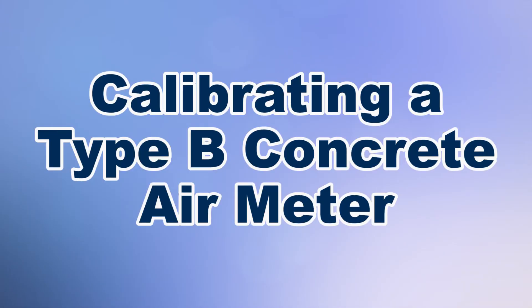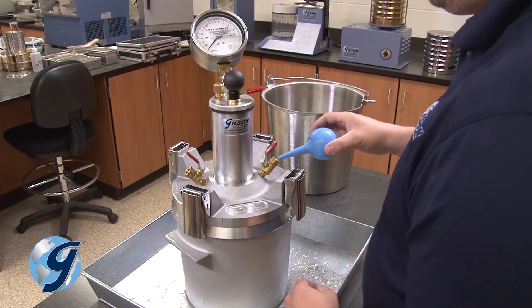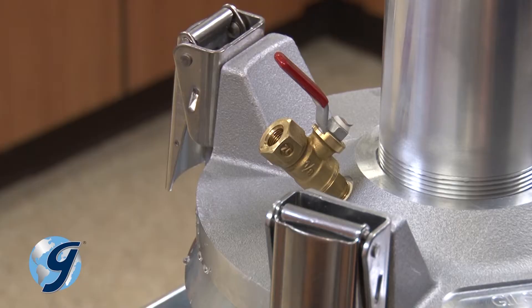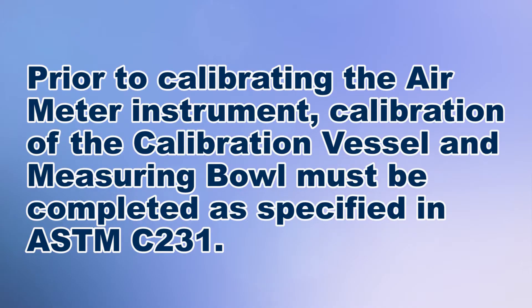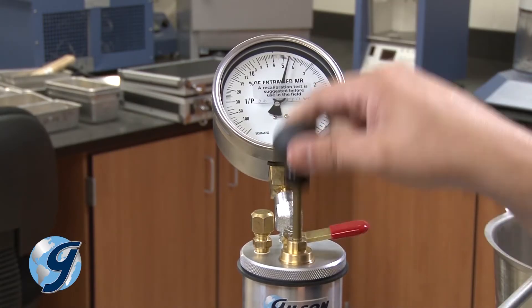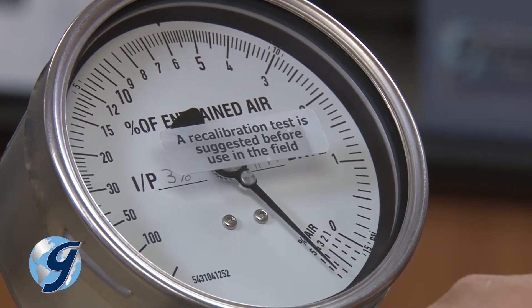Today we're going to demonstrate the calibration of a Type B concrete air meter used for determining the air content of concrete mixes as specified in ASTM C231. Please note, this presentation does not demonstrate the calibration of the sample chamber volume or the calibration vessel, which must be completed before calibrating a Type B concrete air meter.